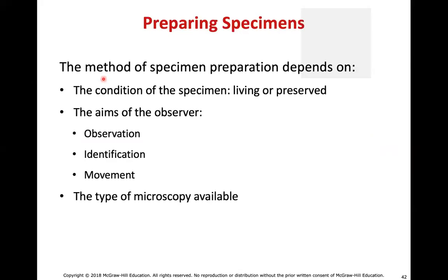Okay, so again, just kind of go over and look over the different types of microscopy. Again, what we typically use in a microbiology lab is just going to be bright field light microscopy, okay? The only thing that you would not be able to see with bright field light microscopy is viruses, because they do fall below that threshold there of 2000x magnification.